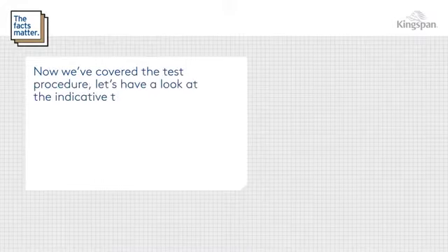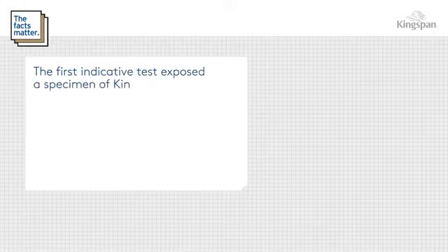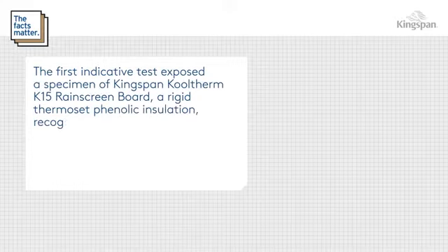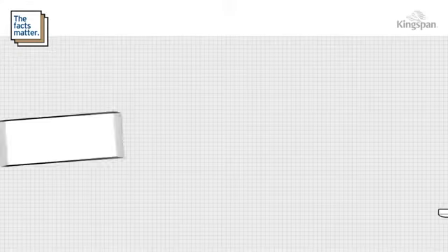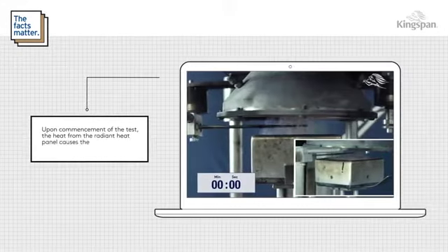Now we've covered the test procedure, let's have a look at the indicative tests that we carried out. The first indicative test exposed a specimen of Kingspan Cooltherm K15 rainscreen board, a rigid thermoset phenolic insulation recognised as combustible, to the radiant heat panel. Upon commencement of the test, the heat from the radiant heat panel causes the specimen to undergo pyrolysis.